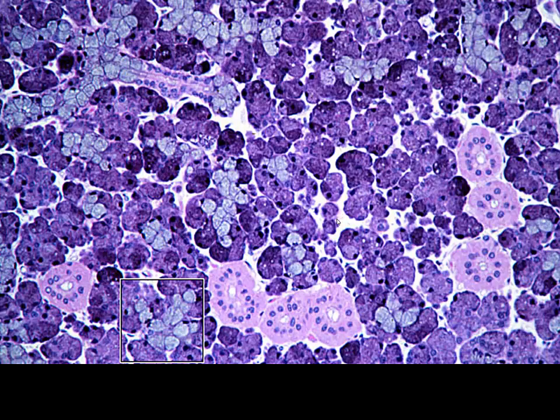At higher magnification again, we can pick out the purple color for our serous acini. Here we have mucus cells, mucus acini. Here we have intercalated ducts that are diving into our acinus here in this mucus acinus. And then we have a lot of these cross sections. Even though at this magnification it's difficult to see, I think you can sort of see the radiating nature of the striations along the basal surface. These are the striated ducts.